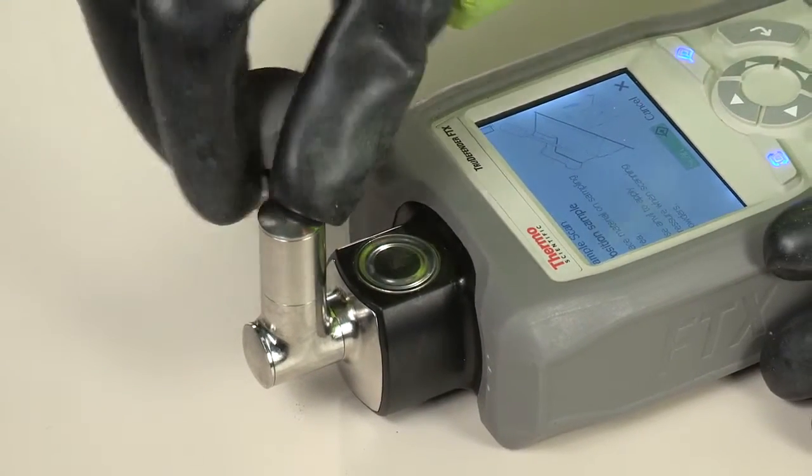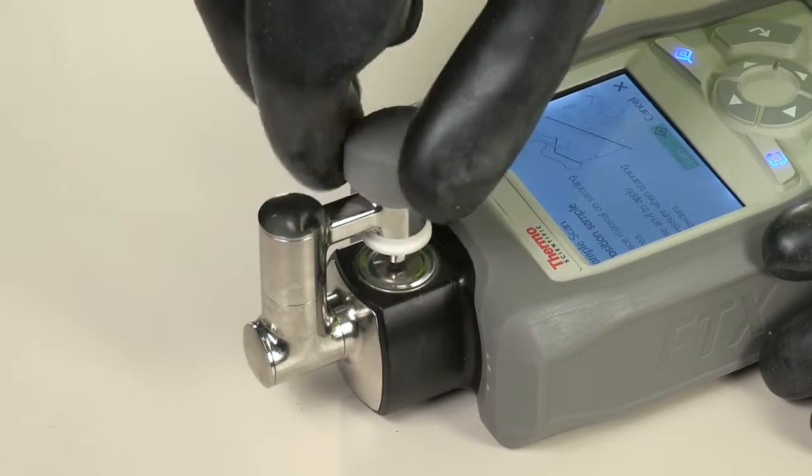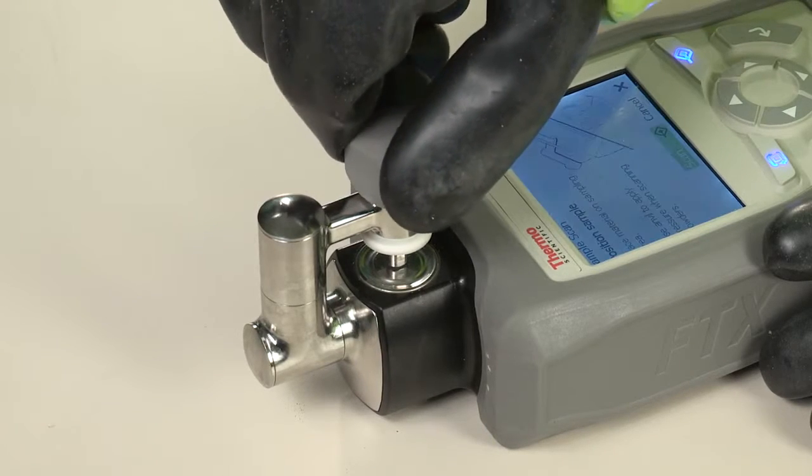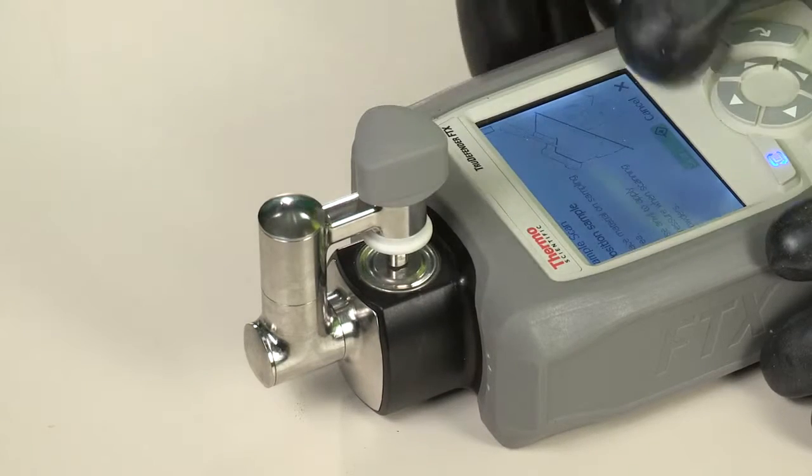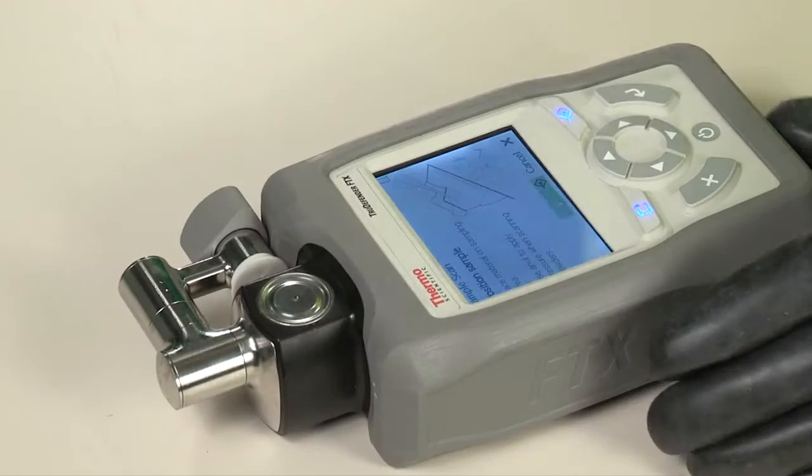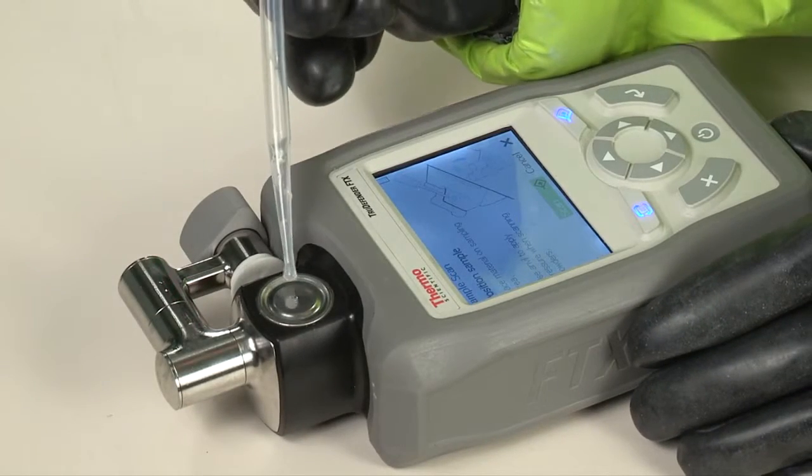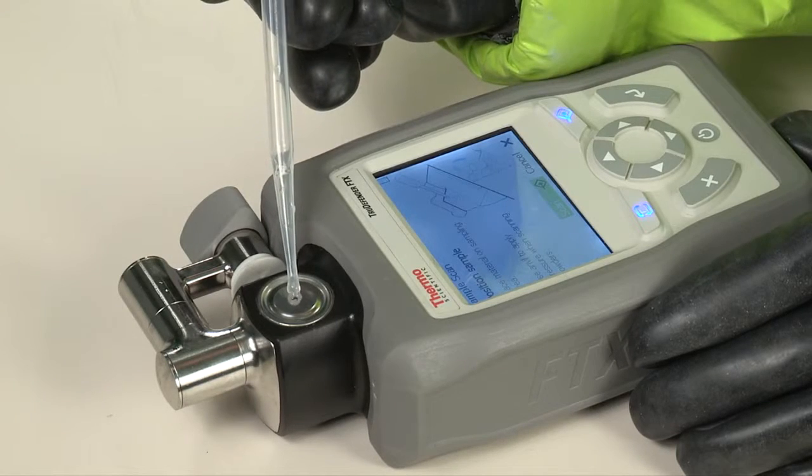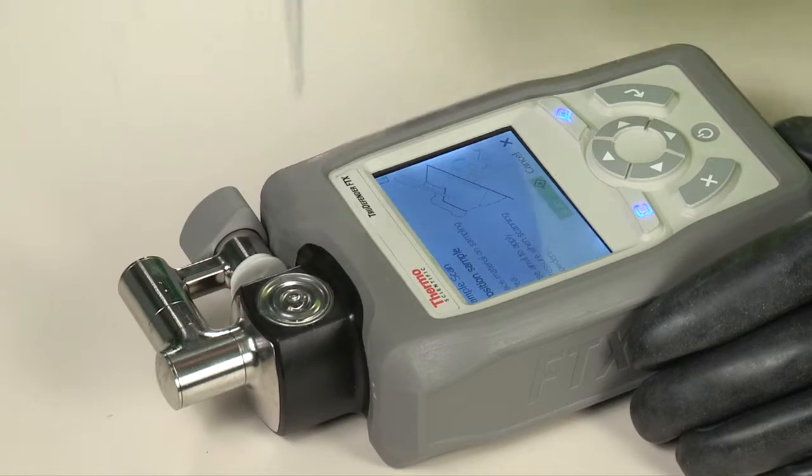The self-contained anvil mechanism ensures there are no exposed threads or friction points which could trap debris or explosives residue and serve as a potential detonation risk. These features also prevent chemical entrapment which could contaminate operators or subsequent samples.